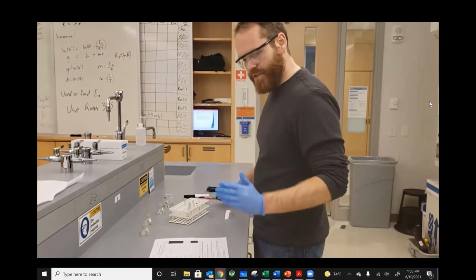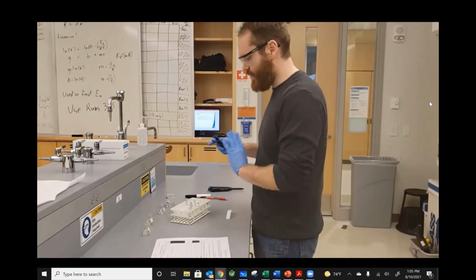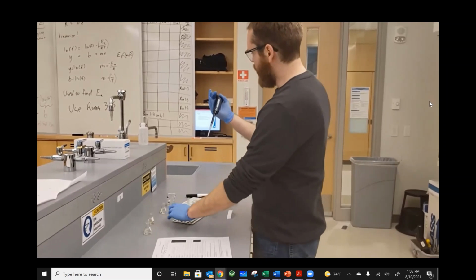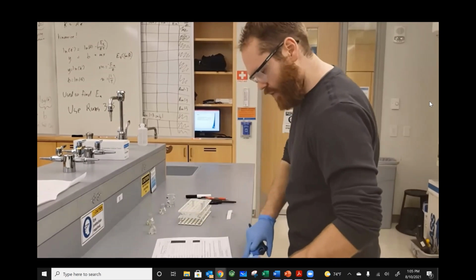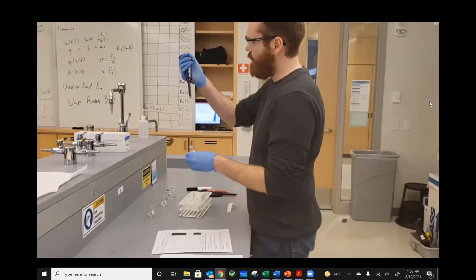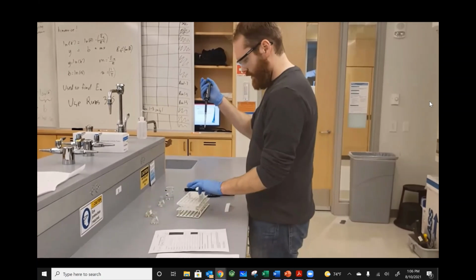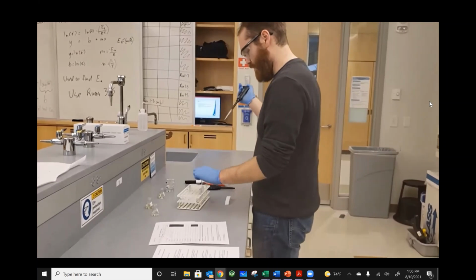So I'm going to first start by putting my water and hydrogen peroxide for run 1 into a test tube. These are not going to react with each other, so I don't have to worry about the reaction beginning to occur. So I'm starting with 400 microliters of hydrogen peroxide, just making sure I'm following everything correctly. Yes, 400 microliters of hydrogen peroxide into the run 1 test tube. I pressed the first stage, not the second stage, take in my solution, which is 400 microliters. Place this into my test tube. Clear out all of the remaining solution.